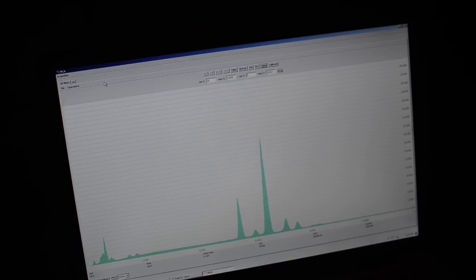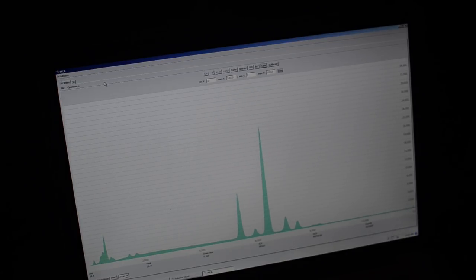If I was actually doing any quantitative analysis and getting a percentage of my mass and things like that out of the spectrum, I wouldn't be varying the probe current as widely as I am right now. I'm just diving in to get higher count space. But you want to keep that set at the same probe current throughout your entire calibration and acquisition when you're doing actual real analysis. Right now I'm at 13 nano amps, which is quite large.